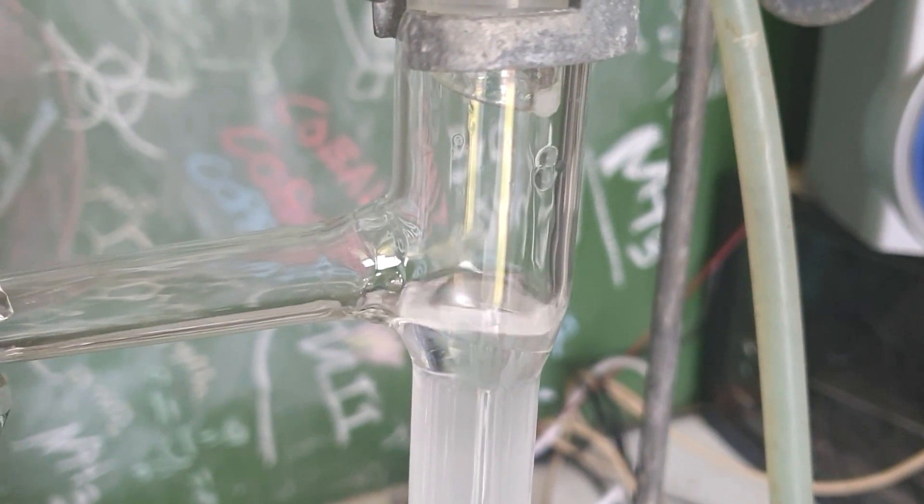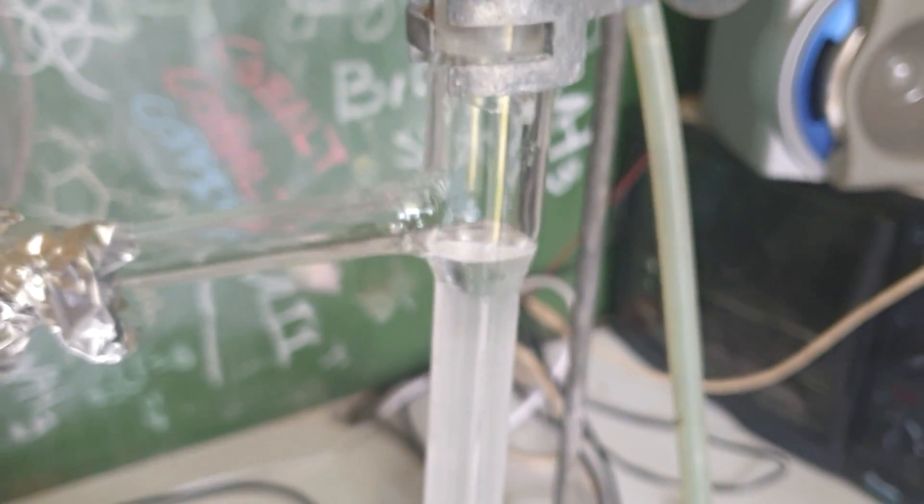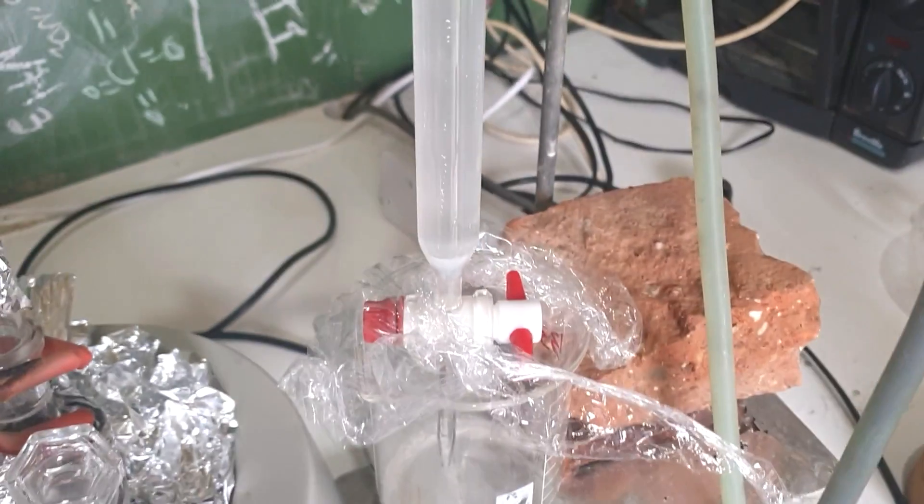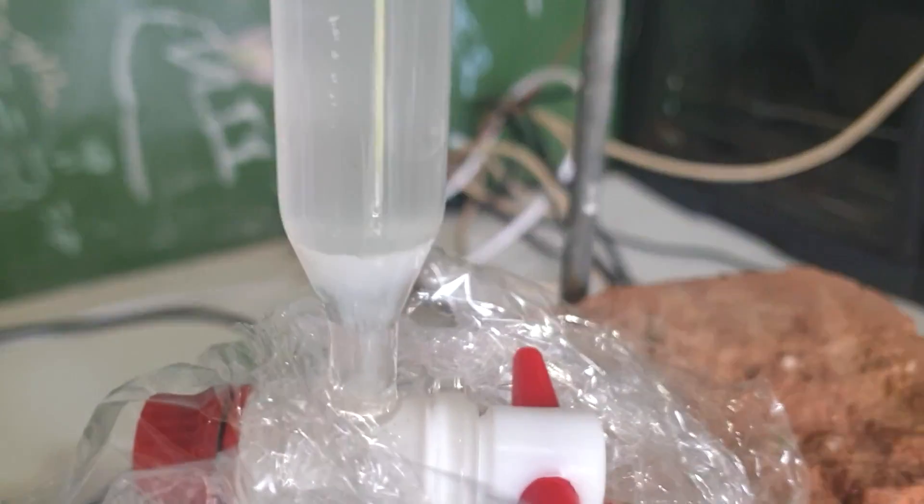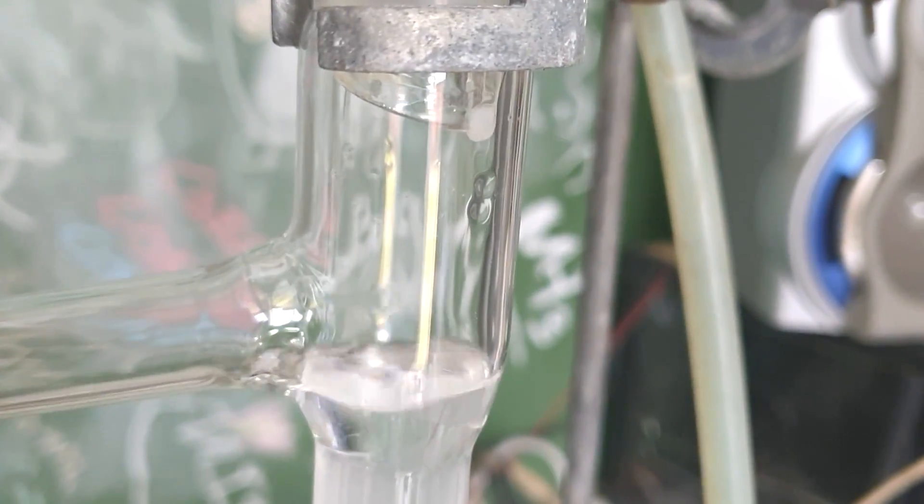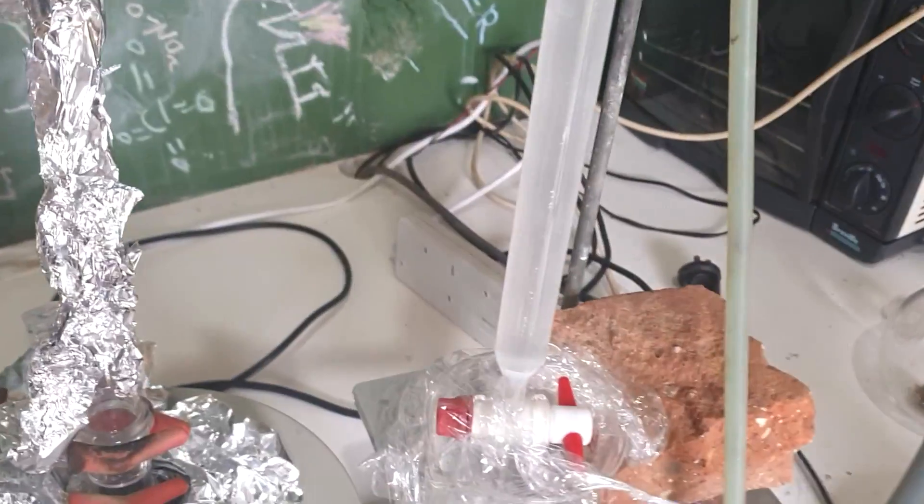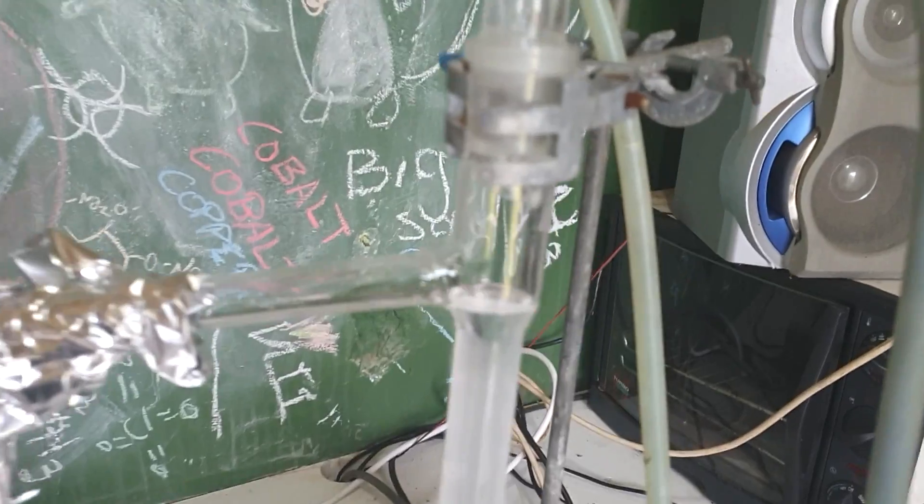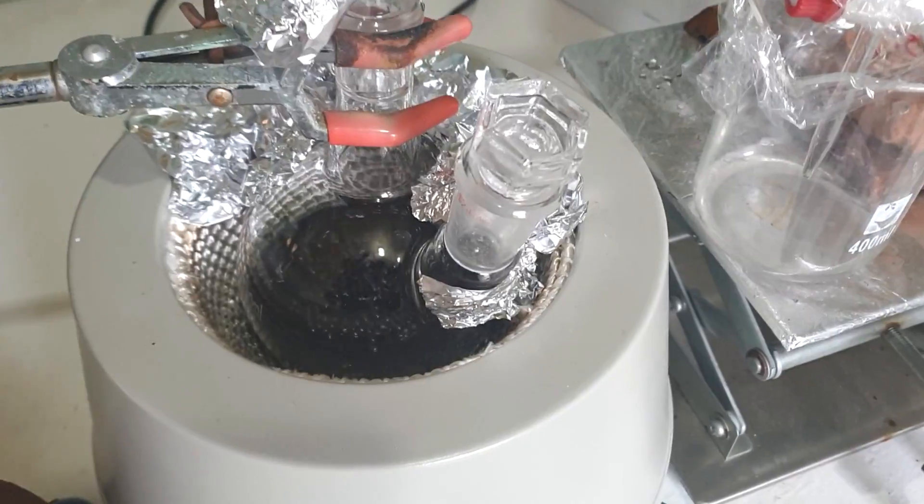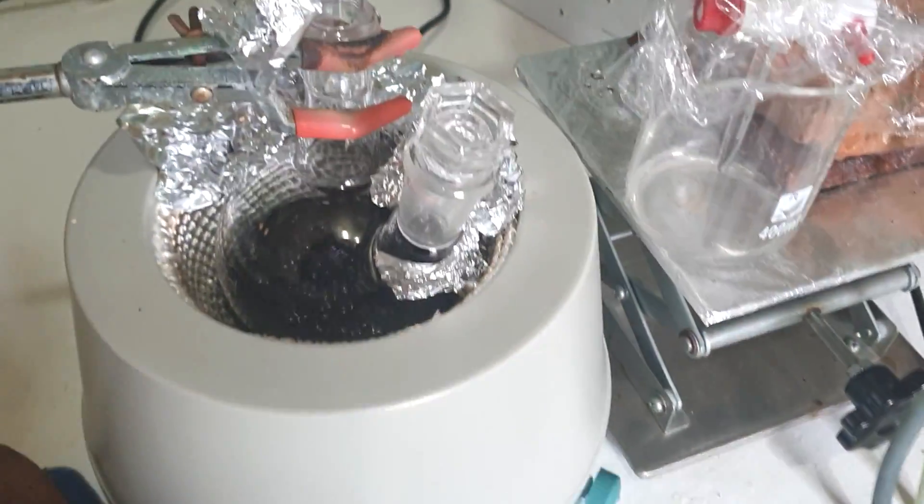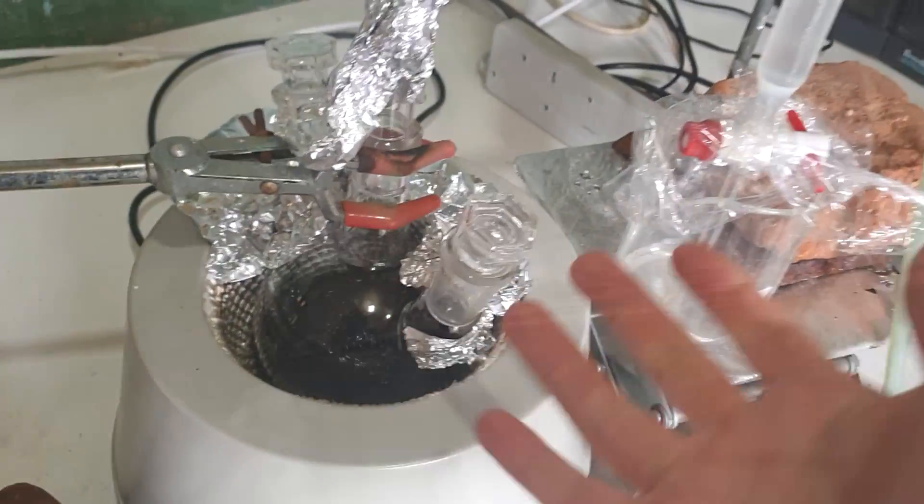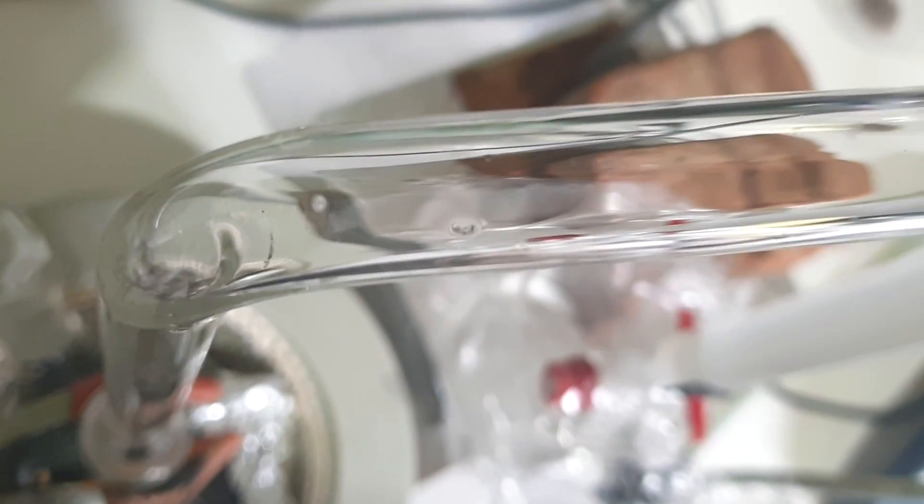You can still see some water droplets sink there, so we are still getting some water through into the trap. It's coming over a bit weird, a bit cloudy. Don't know what's up with that, but we're just going to have to keep monitoring this until we get no more of those water droplets sinking. It's hard to think how it could look any worse than it does currently.